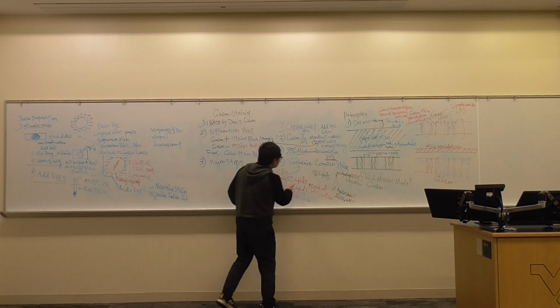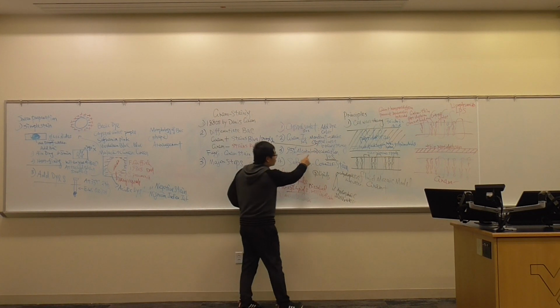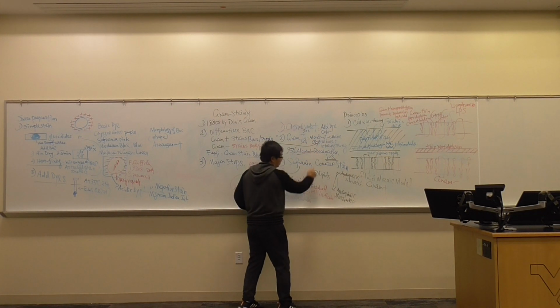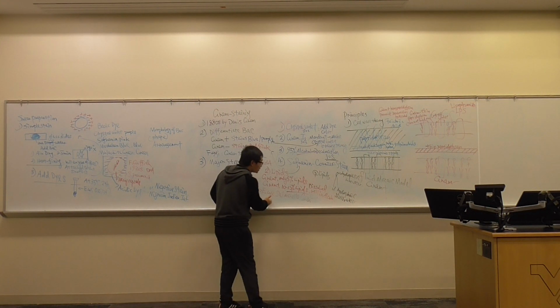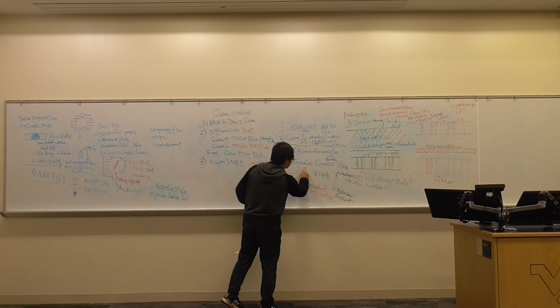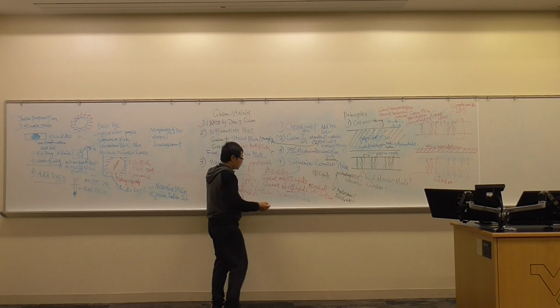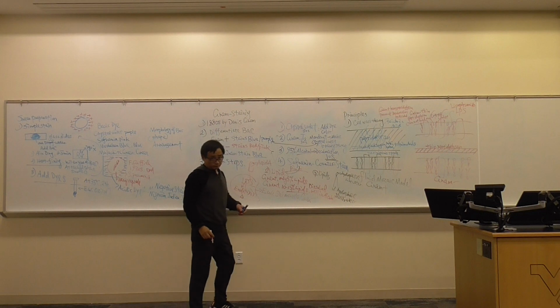So the lipids with the dye dissolve in the alcohol, which means the decoloration is well operated. So what happened? At that moment, it is blank. There is no color there, ideal. So we're going to counterstain. Add the safranin. It's going to show the pink color of safranin. Okay, so that's the whole story.